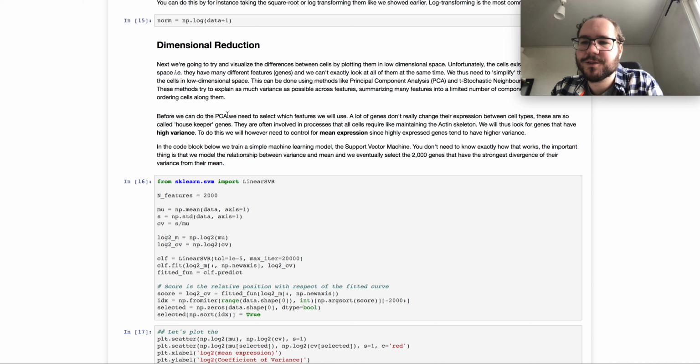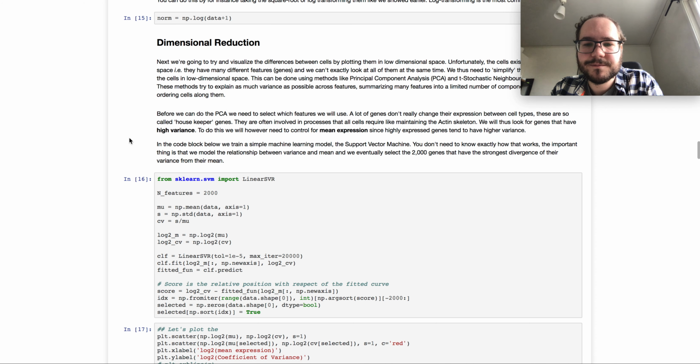the same biological program. So what you do with PCA is find sources of variation. If you have 50 genes that all go on or off together, they will also correlate together and they will then end up in the same component. So this is what we're doing here.